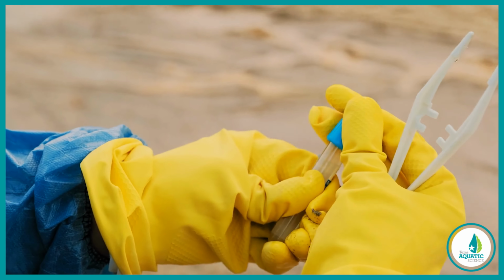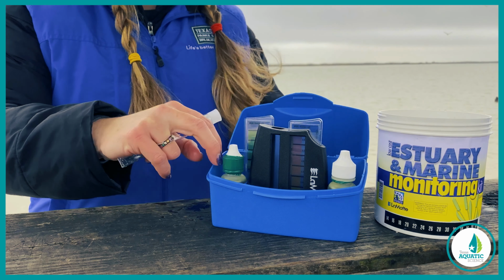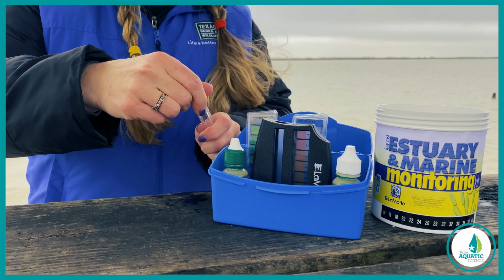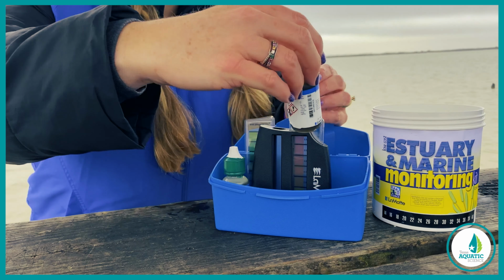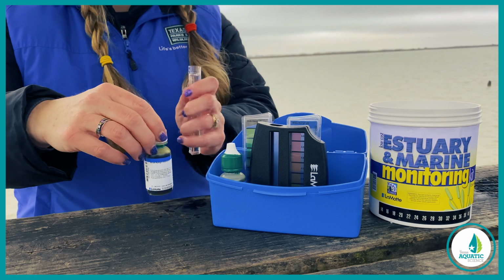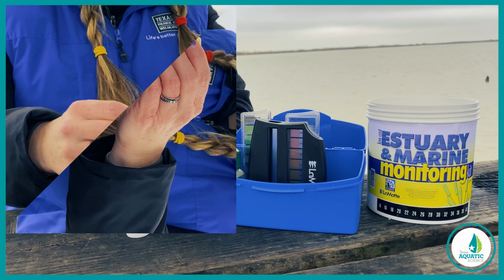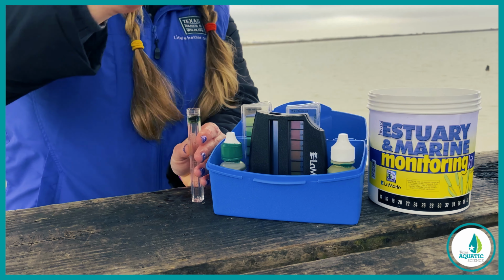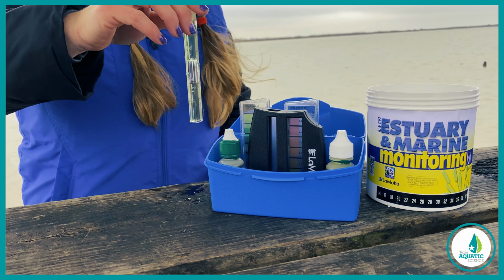cause long-term health problems. Here we are on the Gulf Coast, ready to carry out a simple pH test. We begin by filling the test tube to the 10 milliliter line with our sample water. Then we add 10 drops of the pH wide range indicator reagent. Once done, we cap the test tube and mix the sample by inverting the tube until the reagent is thoroughly mixed.